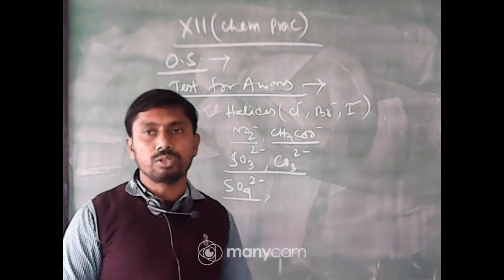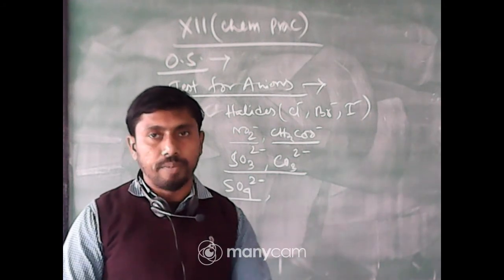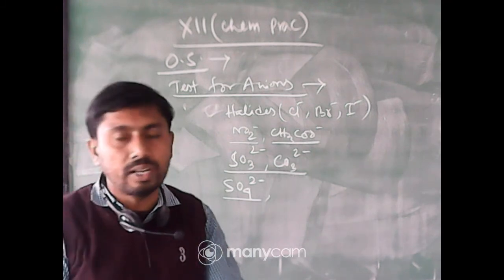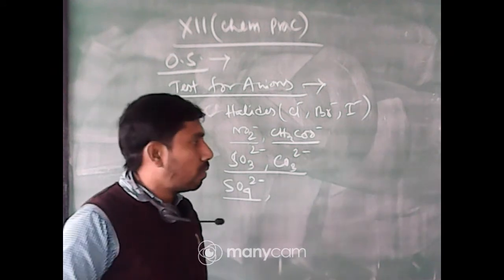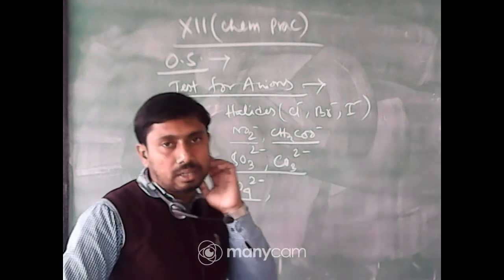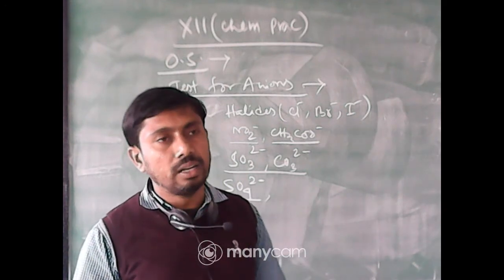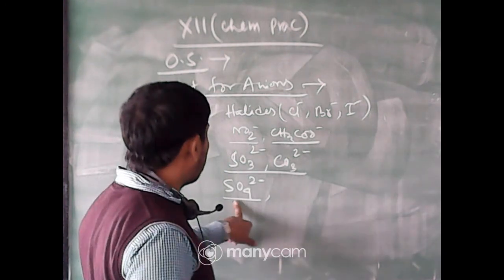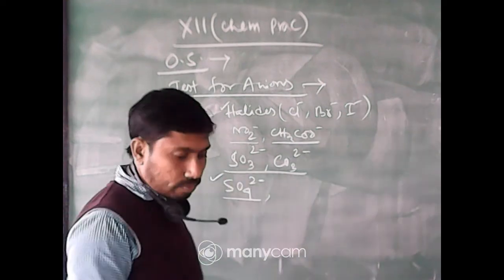Those who go on to a higher degree in chemistry will learn about interfering acid radicals. Phosphates are called interfering acid radicals. Why are they interfering? Because if present, they have to be excluded first in the group separation, then you go through the test for anion. Now first of all we test for halide and then for sulfate.